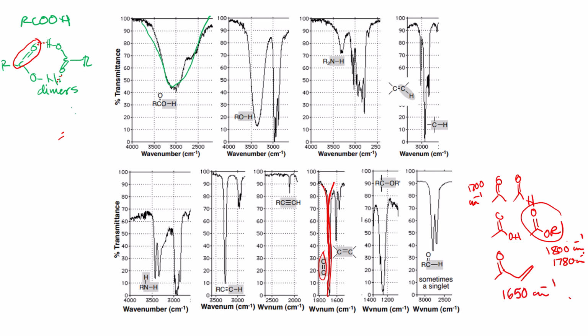These are not exact numbers, to give you an idea just where things are. So this is about compounds with carbonyl. We have this distinct shape for carboxylic acid, and the other band at around 1700 for all the carbonyl compounds. But there is one very interesting band to distinguish between aldehydes and ketones, and it's this.